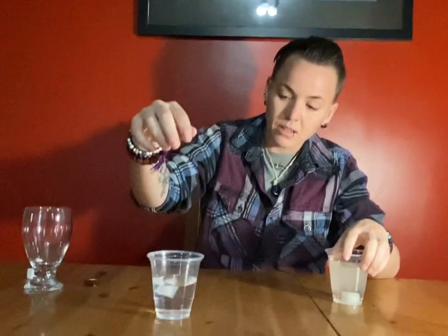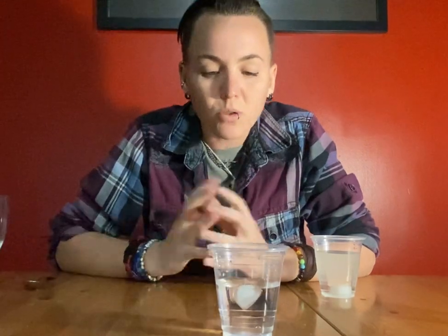So we're gonna do the same thing now with our water. And we've just disproven our hypothesis here. The solid version, the crystal version of water, which is ice, actually floats on top, which is the exact opposite of basically every other substance known to humanity in science. And if it wasn't for water having this really, really unique property of doing this, life on Earth would not be possible. And you might be wondering, well, why is that?